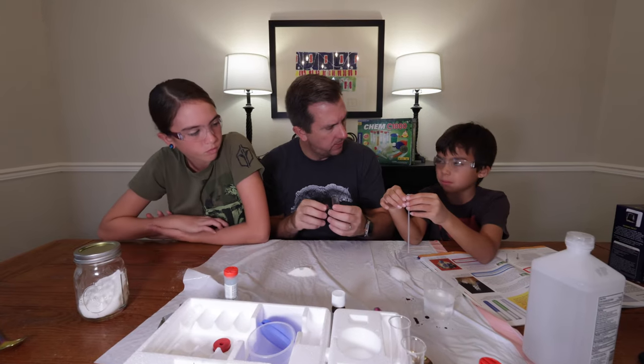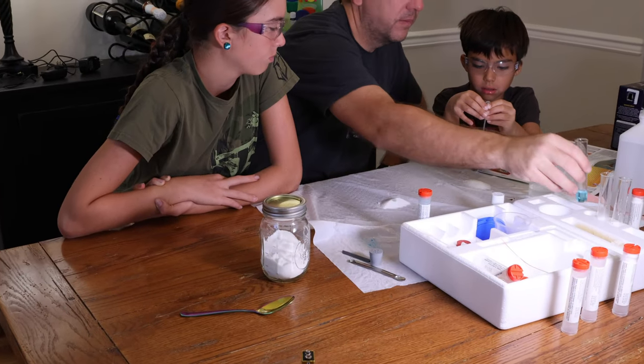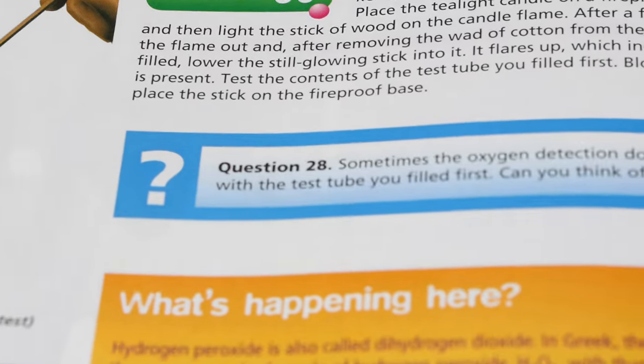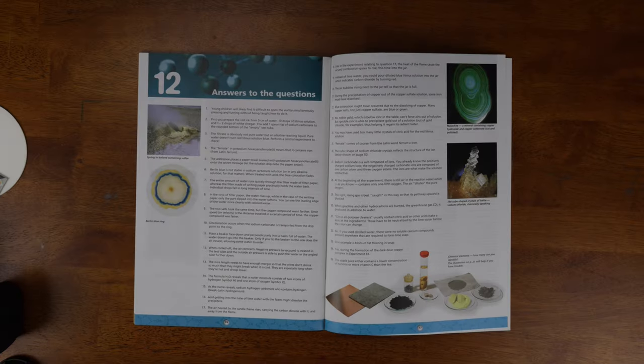For example, one of the experiments in the book is making a chemical that is still used as a modern day dye in the printing industry — in case you ever get that popular question from your kids like, 'Why do I need to know this?' or 'How do we use this in today's world?' They have plenty of examples in the book that go along with it. Additionally, it comes with different questions on almost every page that will allow you to further engage your student as you're doing the experiment. There's also an answer key in the back, which is always a nice bonus.